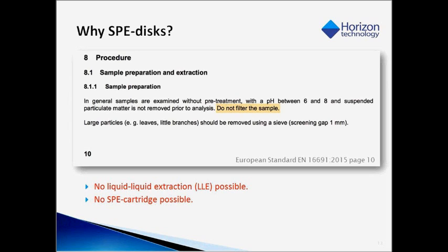As mentioned earlier by Jean-Luc, polycyclic aromatic hydrocarbons are highly soluble in organic solvents and poorly soluble in water. Any PAH adsorbed on particulates must be extracted along with the ones dissolved in the water sample. An external filtering of those particulates may run the risk of underestimating the actual amount of PAH in the water sample.